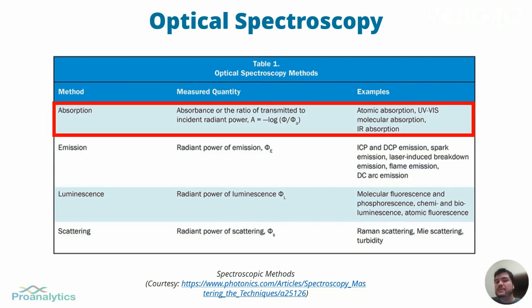The transition happens from a lower energy state to a higher energy state, called the excited state. Since different bonds have different energy states, the absorption occurs at different wavelengths of light for different molecules, resulting in different absorbance curves. The degree of absorption is also critical to determine the concentration of the sample, hence the quantification of the sample.